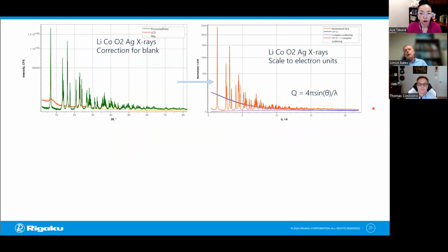And why do we measure to high Q? We measure to high Q so we can hit the asymptote. This is the asymptote. It means that the sum over f squared is asymptotic, or has the same high Q behavior as you get from the measured data. Now, if you measure with copper you can measure to about 7 or 8 in Q somewhere here. So if you chop the data off at this point, there's no way you can achieve the asymptote. So doing automatic PDF calculation is troublesome at best.